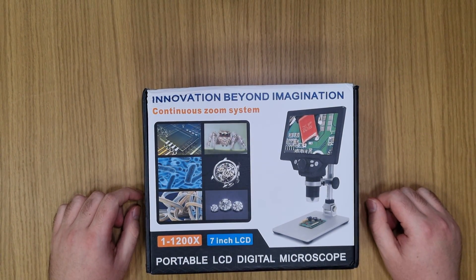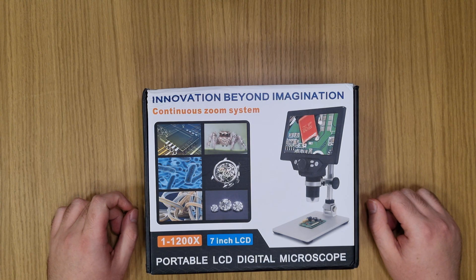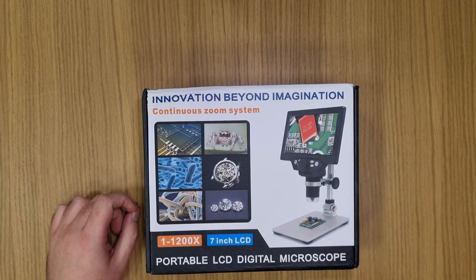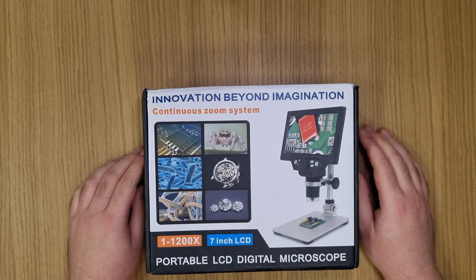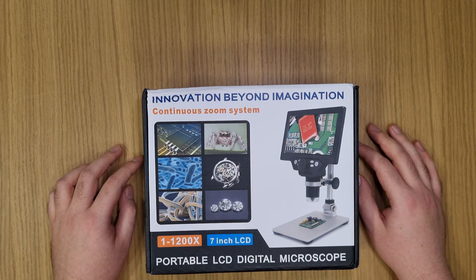Hello, I'm Adam and today we'll take a look into a digital microscope from AliExpress. I bought this for about $50 and I'm looking for an alternative to zooming using my mobile.